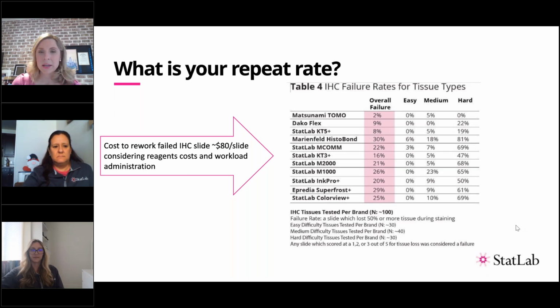Some of those slides down at the bottom, probably not so good. You might have to do a lot of extra compensating to figure out how not to lose that tissue. Or other slides there might not be best for IHC. They work great for holding on to special stains, like for nail, if you're a derm lab, but for other difficult tissues might not be the best there.